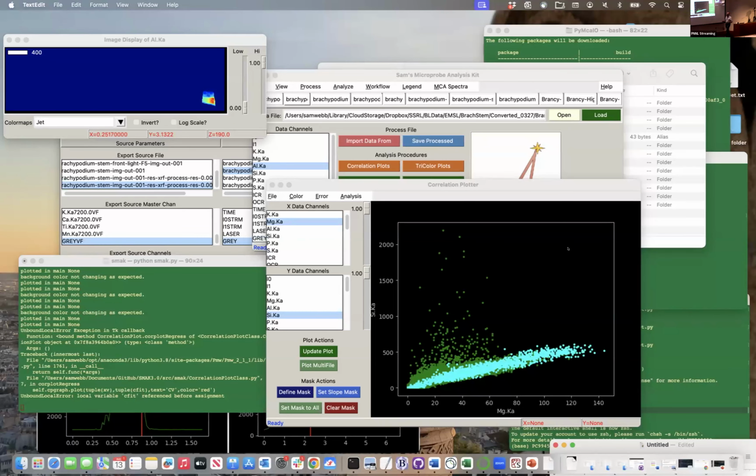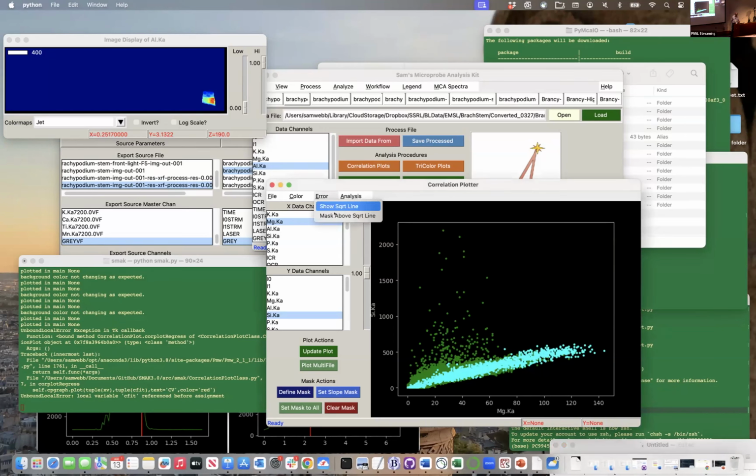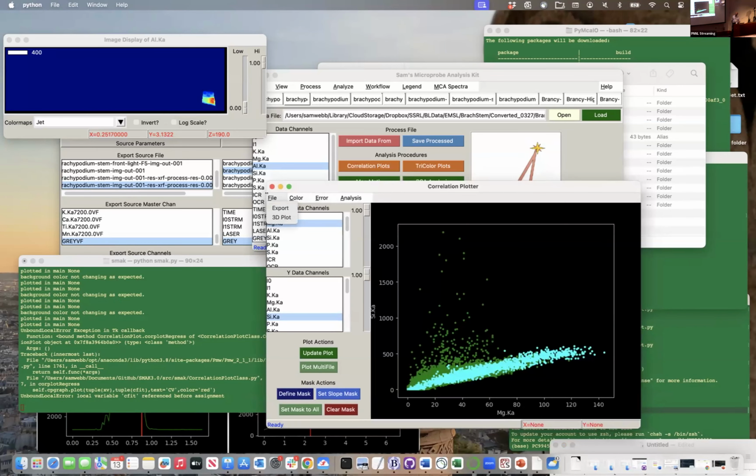It's probably pretty obvious, but I guess it's easy to save off a text file of your spectra, right? You want to plot it somewhere else. Yeah. Almost every one of these regions here has a save function or an export function typically. Export right there, for instance.